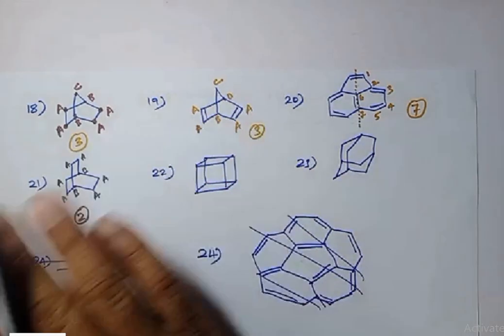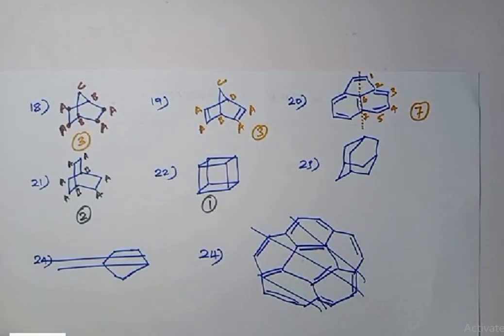In cubane, all carbon atoms are equivalent. So we get only 1 signal for cubane.